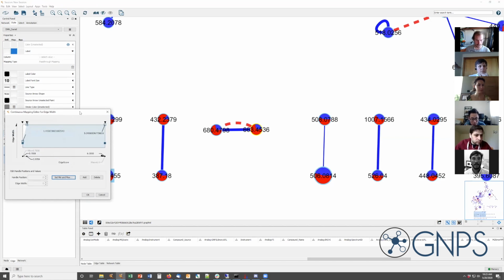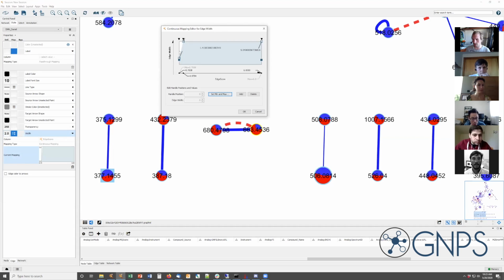But you see I only made the gradient for the very first part from 0 to 1, because that was what was interesting for the cosine. And the higher numbers are all from the correlation edges. So you may need to get a little creative and figure those things out.